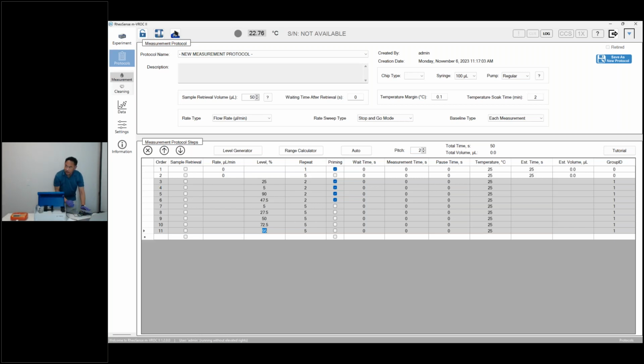One question is, how do you export the data format for VROC II? You can export it in PDF, CSV, or Excel. The VROC II and Initium 1 Plus are also 21 CFR Part 11 compliant, so there is a database which will save all of your data, and it cannot be manipulated. If you are in a GMP environment, for example, it works very well in that type of strict testing.